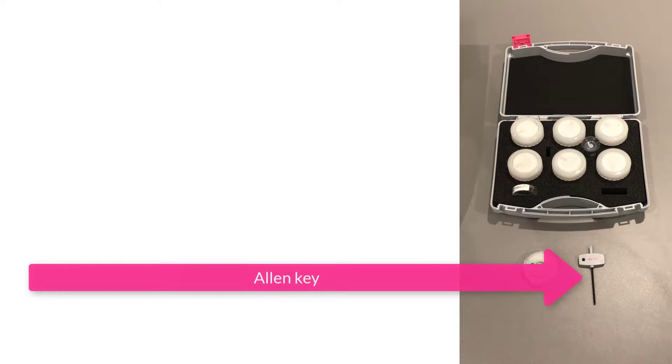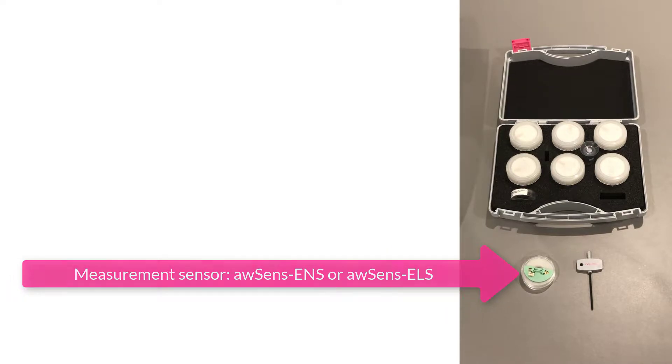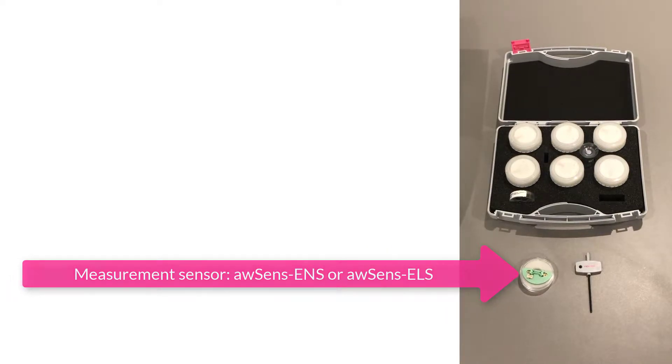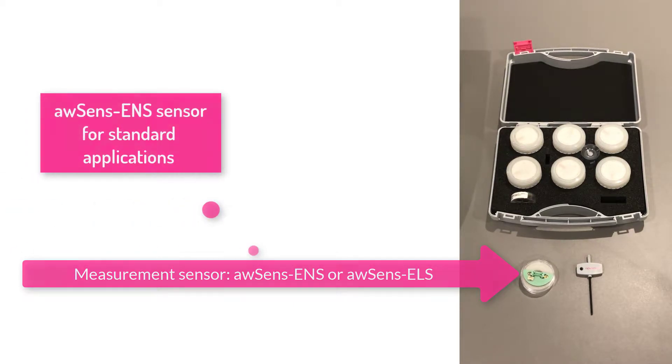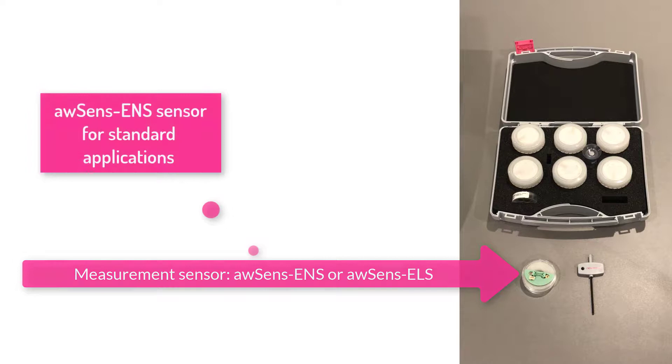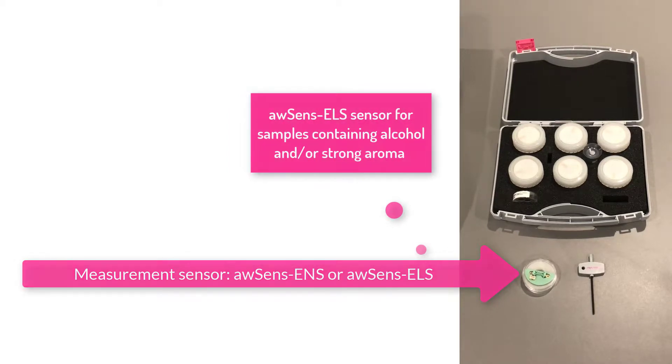One Allen key, which was included in the kit and can be found in the SALT standard case. A measurement sensor as a spare. Please consider that there are different versions available: the awSens-ENS sensor for standard applications, or the awSens-ELS sensor for samples containing alcohol and/or strong aroma.